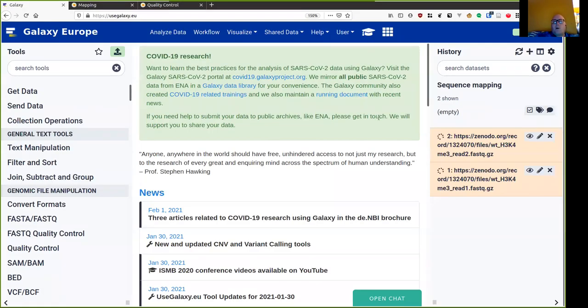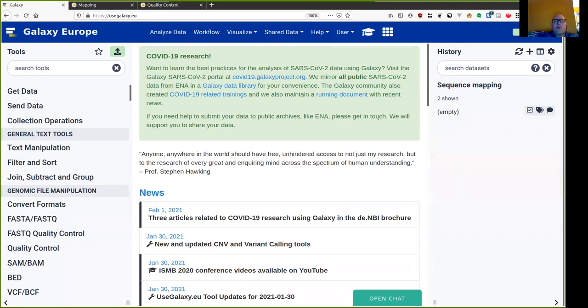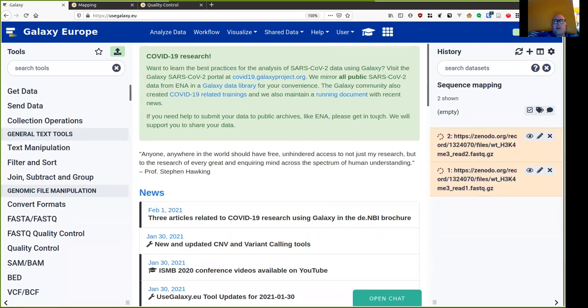After a while, Galaxy will start analyzing the data that we've uploaded to collect some metadata about it, and that's why it has now gone from grey to yellow like this.